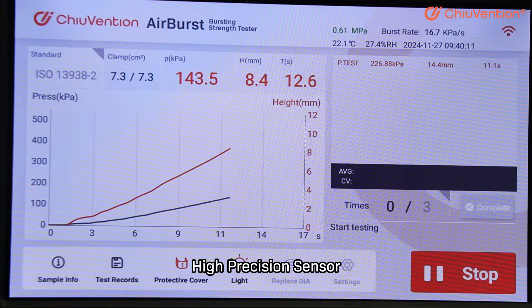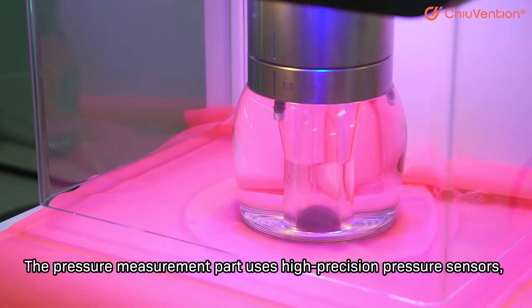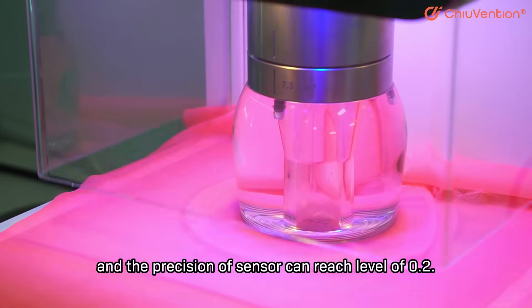The pressure measurement part uses high-precision pressure sensors, and the precision of the sensor can reach a level of 0.2.